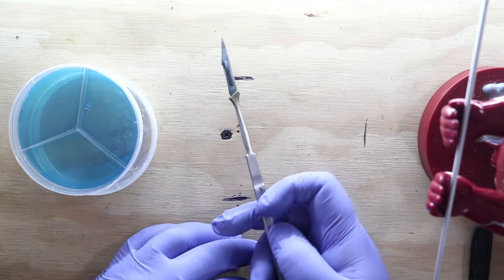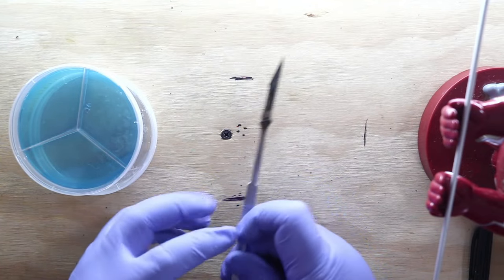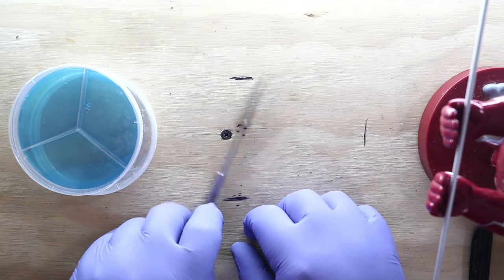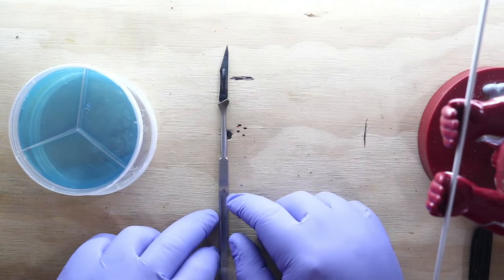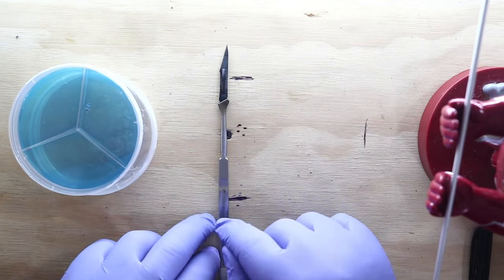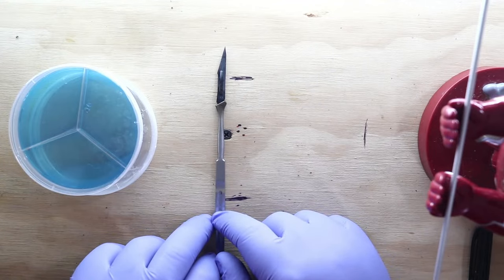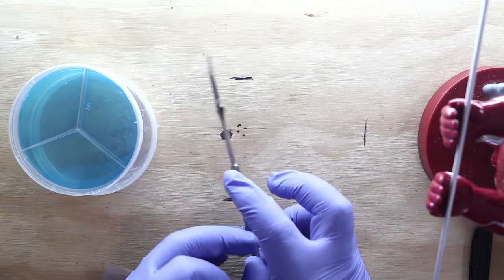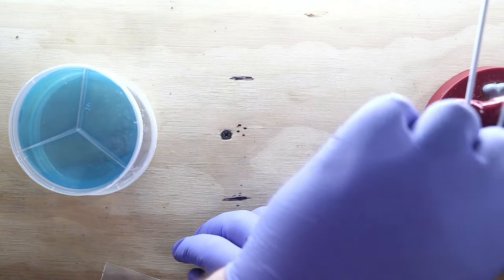This handle is not very common in mycology unless you buy stuff from Paul Stamets. It's like his favorite scalpel handle or whatever, and it is the most comfortable I've come across. I prefer this blade and handle combination, not because of anything important or that anyone needs to follow, but just because it is comfortable in my hand and my cutting style.